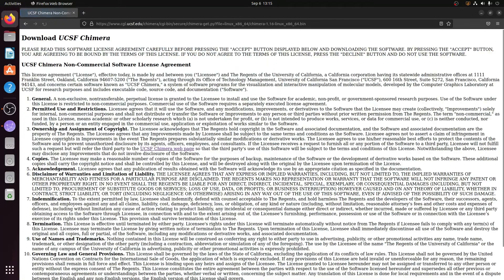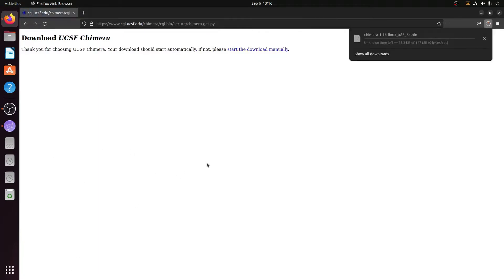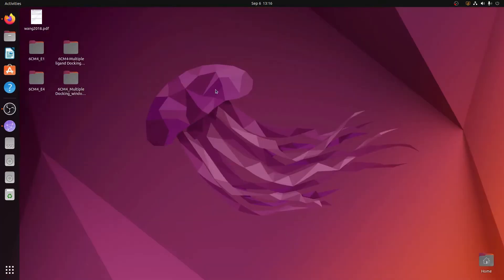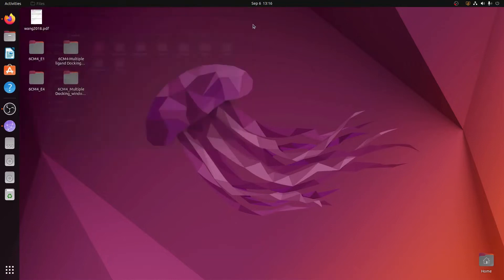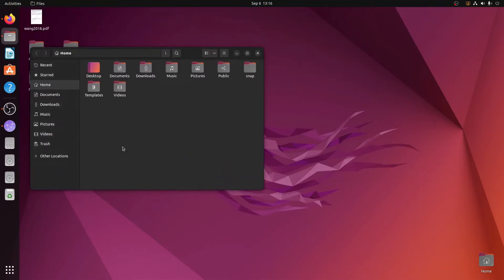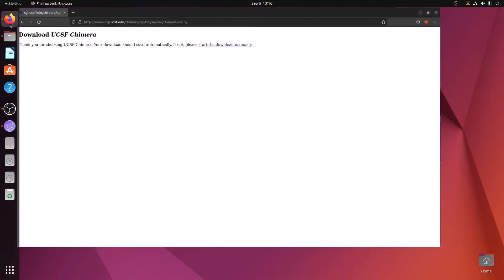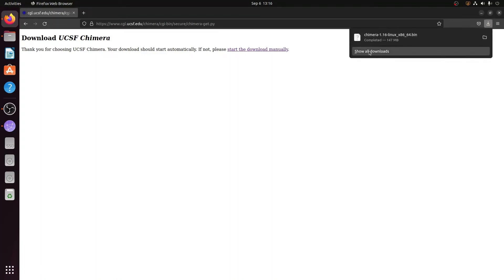Click on it and it will ask you to accept some license agreements. Click Accept, and it will start downloading Chimera into the downloads folder. If you're new to Linux, by default when using Firefox the downloads go into the Downloads folder inside the home folder. The download has now been completed, shown by the red download indicator.